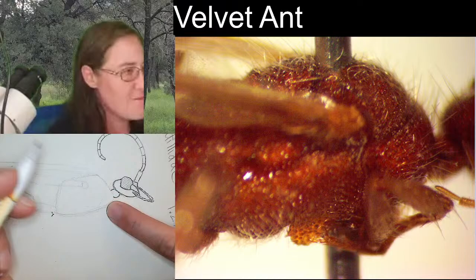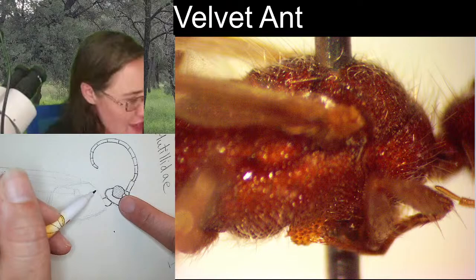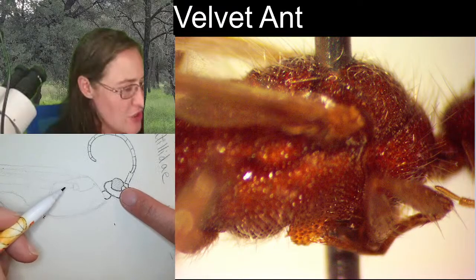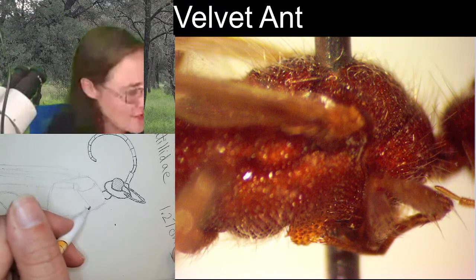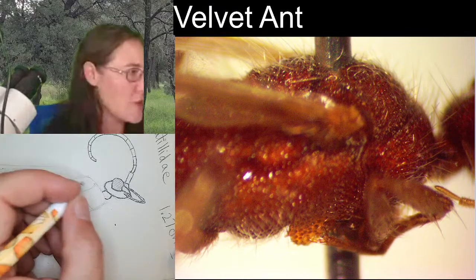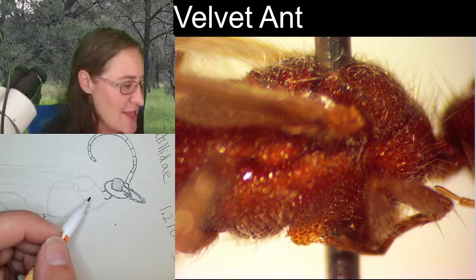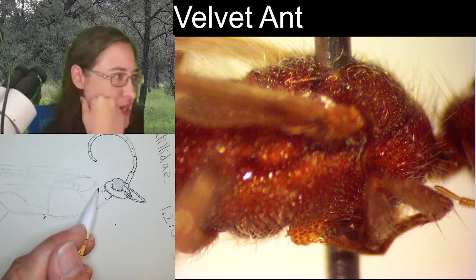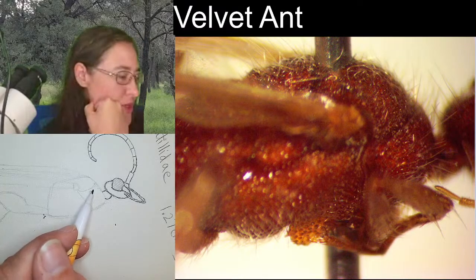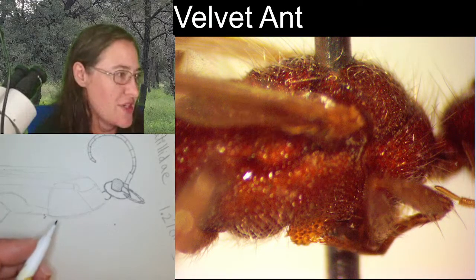So the first plate is right around here along the top of the head, and it is U-shaped, and it goes over to the tegula. And then it does come down and forward right about where that leg is connected, and that's the first segment of the thorax. If you were talking about this region right here, on the top, that would be the pronotum coming around, but once you got to the bottom, it's considered a different segment.